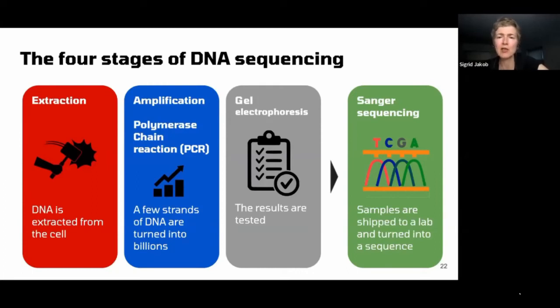The third stage is optional. You don't have to do gel electrophoresis. I know it's a bit of a mouthful, but essentially it's a test where you check whether you actually amplified your DNA or whether you got a blank, which happens before you send it off.